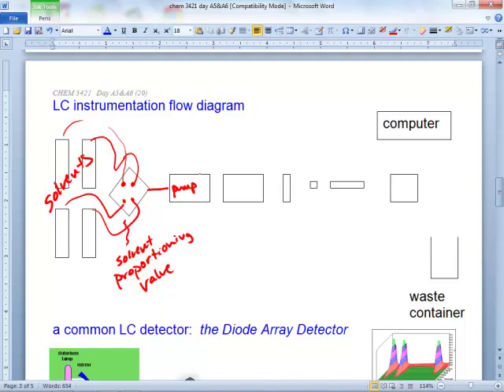So what happens is you would end up getting all your peaks looking like this. And they do. Because that's all we know for engineering, to make a pump. So this next guy, we have to dampen the pulses, they're all going to have a pulse dampener.